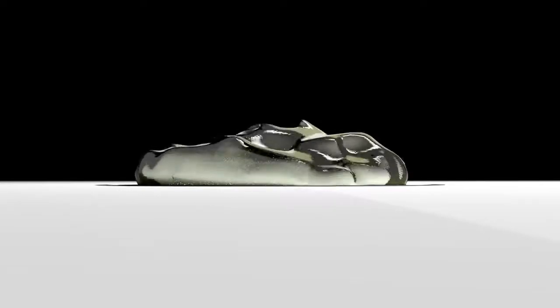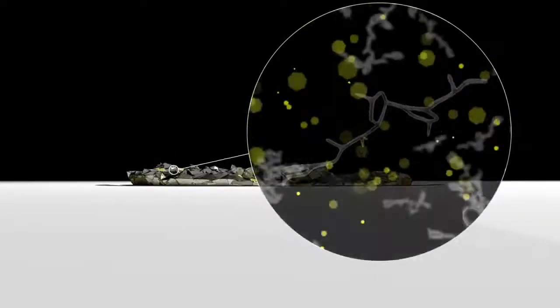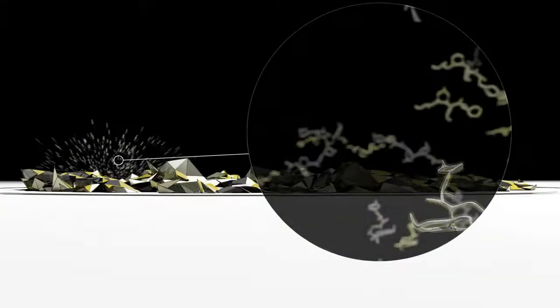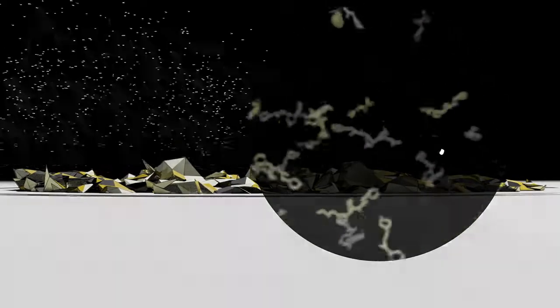As the solution dehydrates, the matrix crystallises around the peptides. A laser is then fired very briefly at the sample. The matrix absorbs almost all of the energy and is vaporised, releasing the peptides in a cloud of molecules. Protons from the vaporised matrix collide and stick to some peptides, giving them a positive charge.